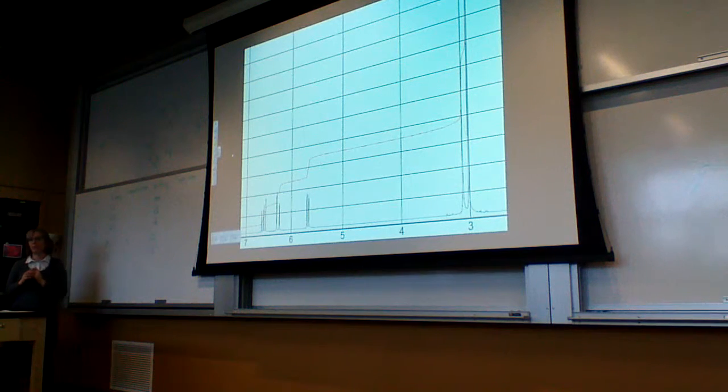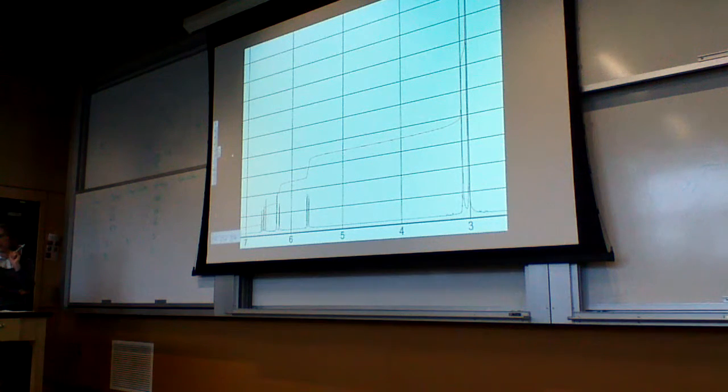And how do we know that those 2 singlets aren't just one doublet, since they're so close to each other? We wouldn't know for sure. Yeah, that is a possibility. The thing you would have to know is that somewhere else, if that's integrating to 6, there needs to be something that is split into a 6+1 septet. And we don't see a septet in the structure. Yeah, that's a good question though. You don't want to make assumptions.